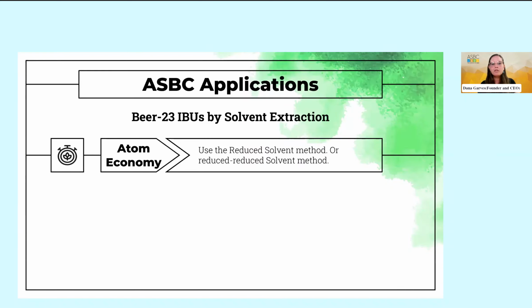So based on a poster put out in 2008 at an MBAA conference, a student went through and measured creating IBU solvent extractions with different quantities of isooctane.